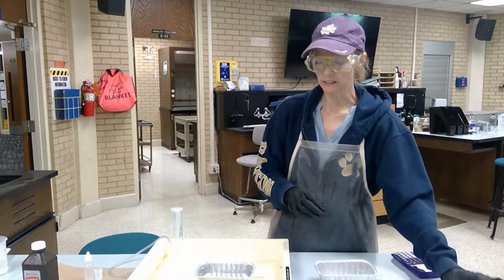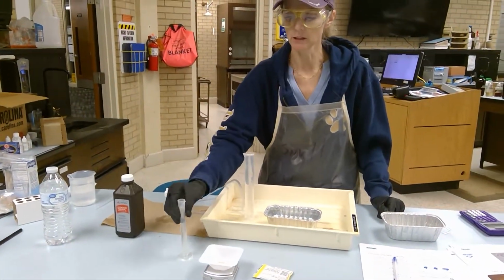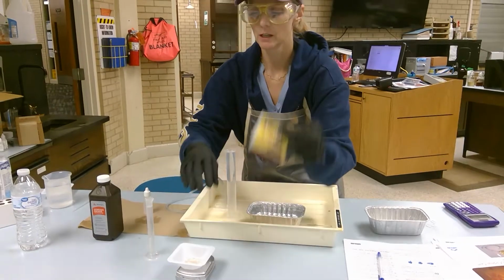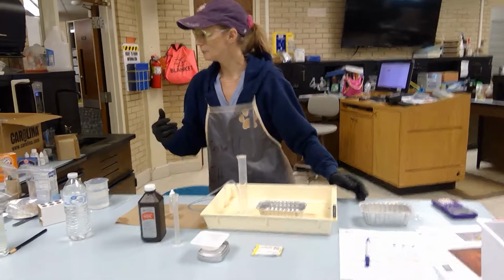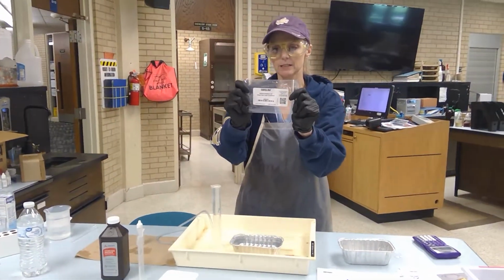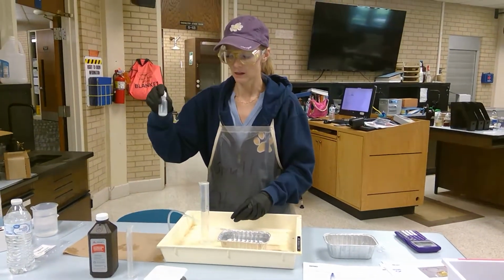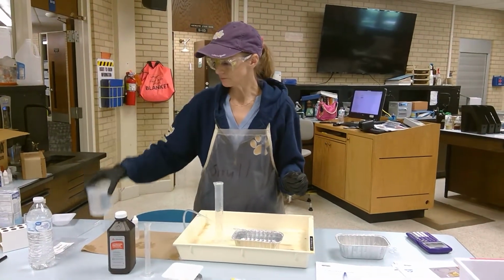Some items that you will need for this lab are your 50 mL graduated cylinder, your 10 mL graduated cylinder, your weigh boat, your scale, yeast, and hydrogen peroxide. You should have been shipped a kit that says determination of a gas law constant, and in it comes a tube, a dropper bottle, and then you also had your beaker.